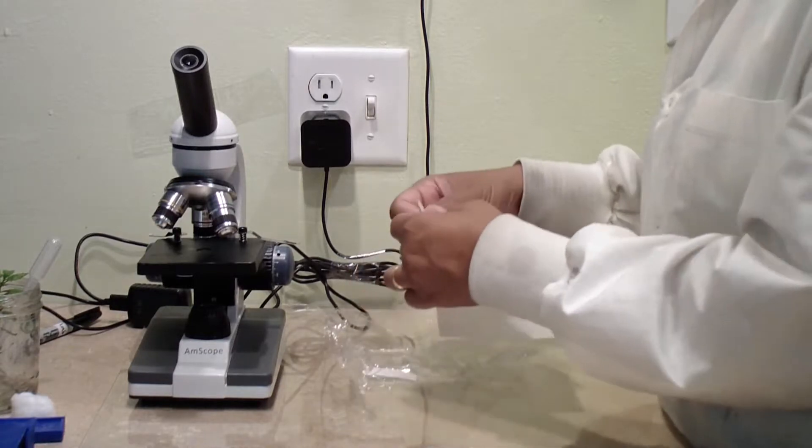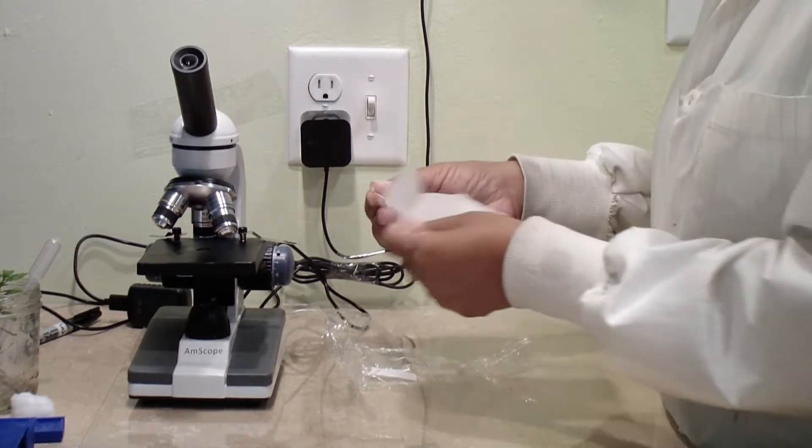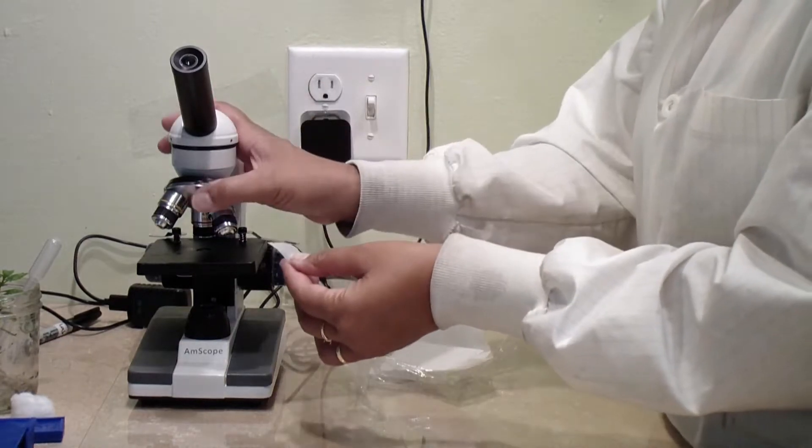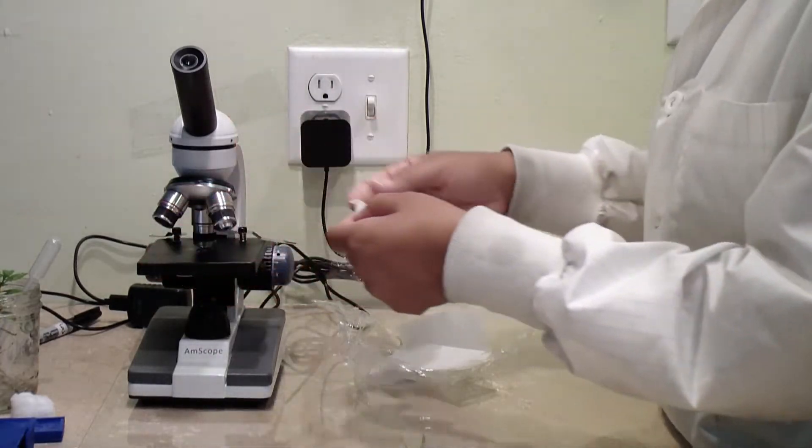When you're done using the microscope, tear a small piece of lens paper from your supplies and dab the lenses you just used clean. It is not necessary to rub the lens.